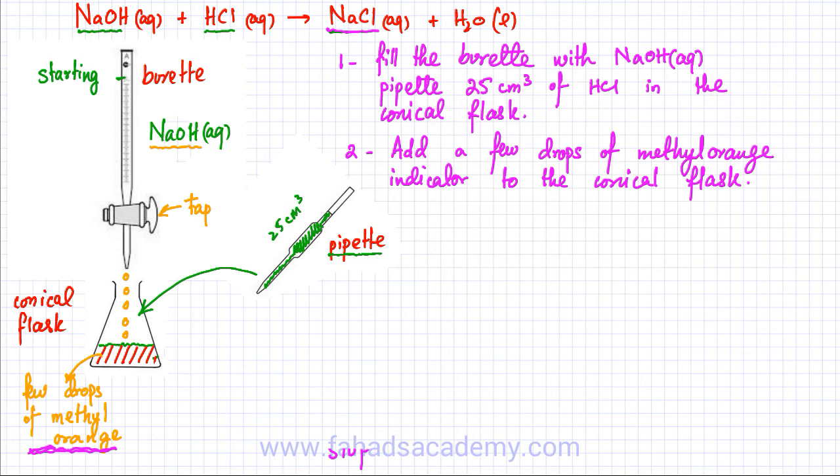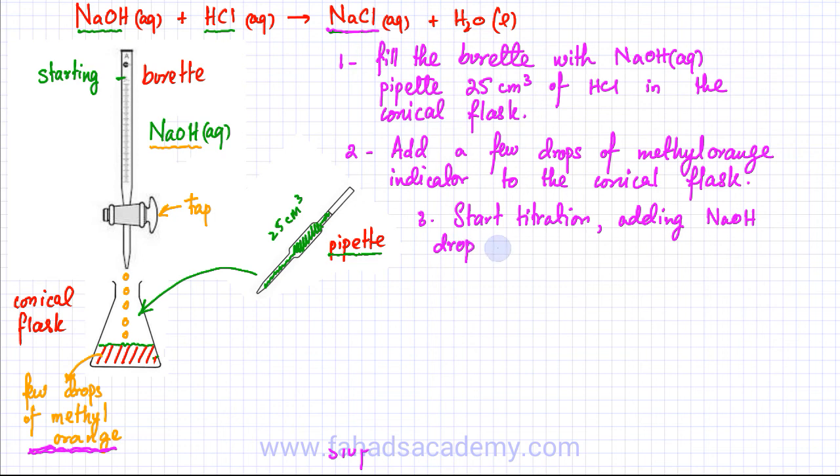Once you have done that, you're going to start the titration now. So the third point is you start the titration, and you add NaOH drop by drop.